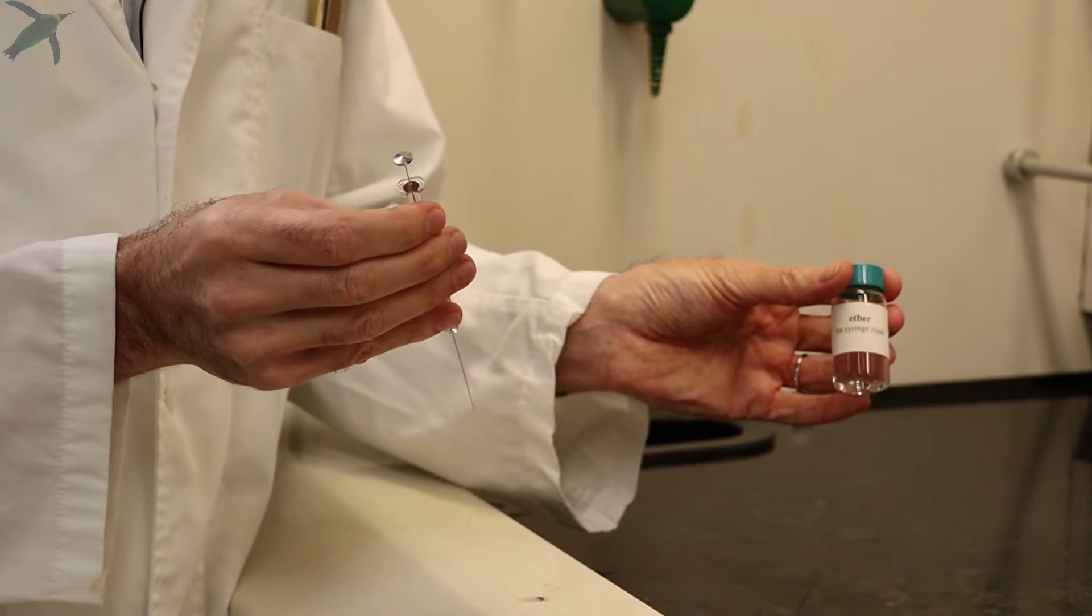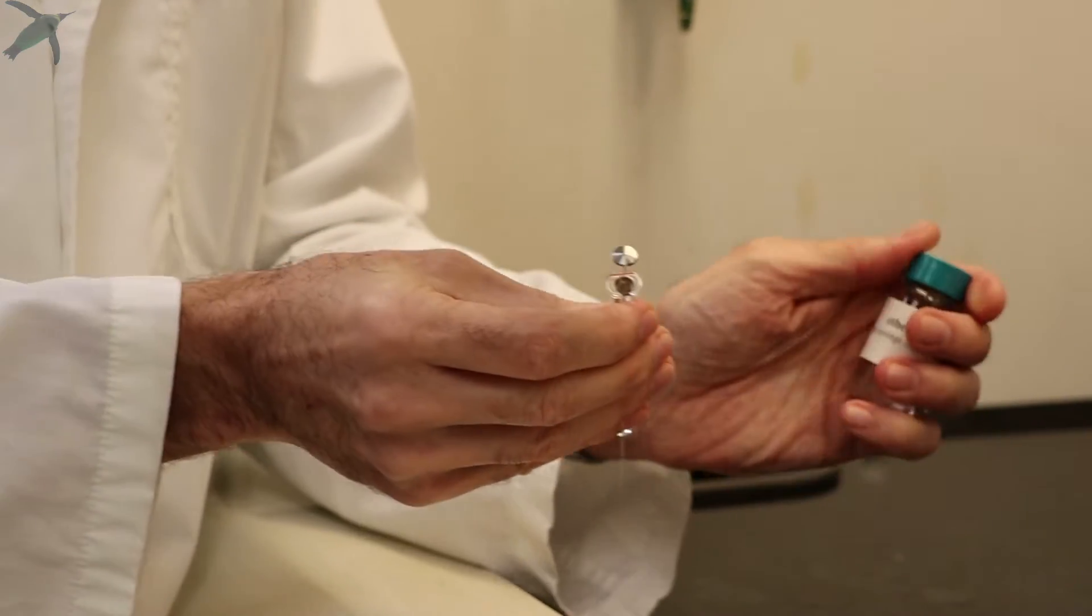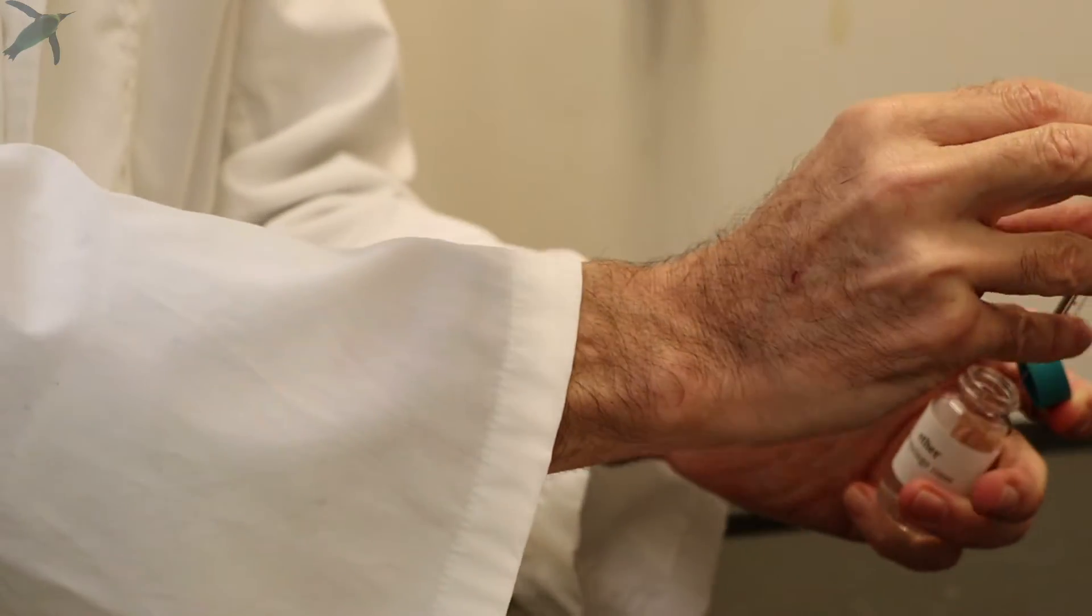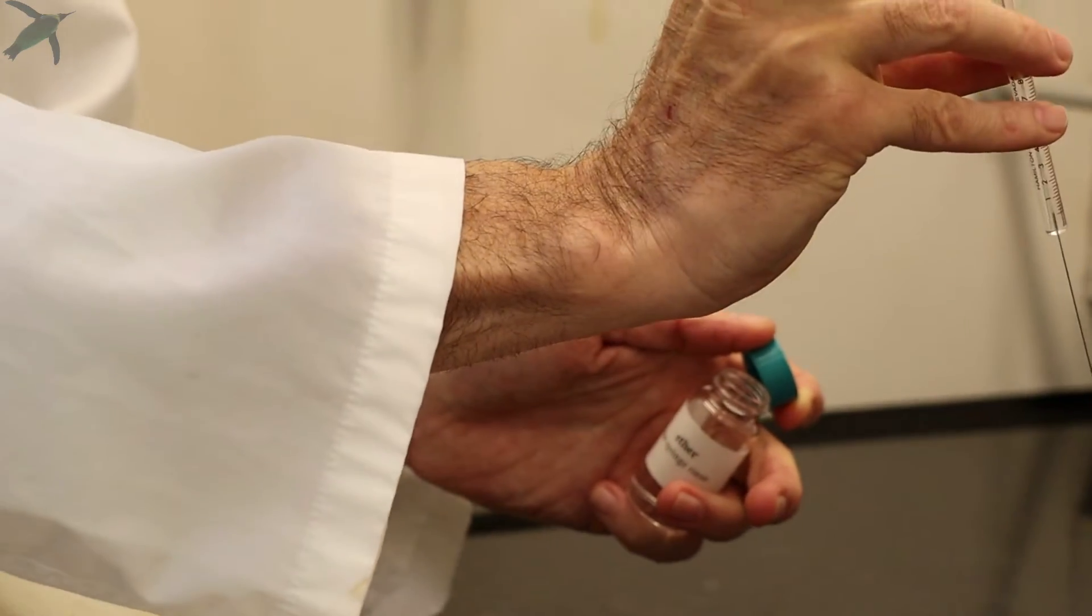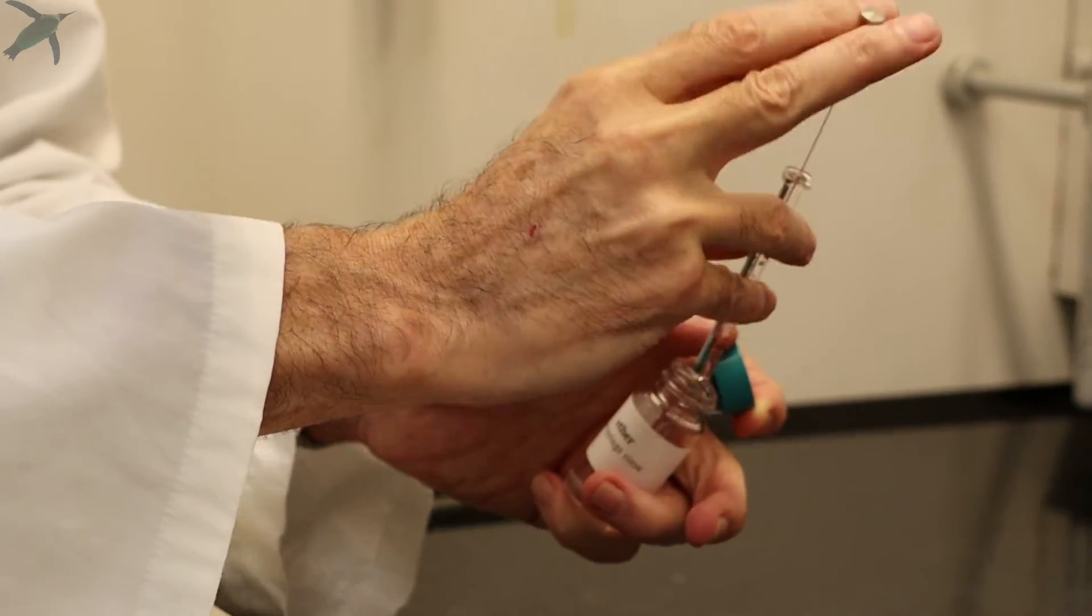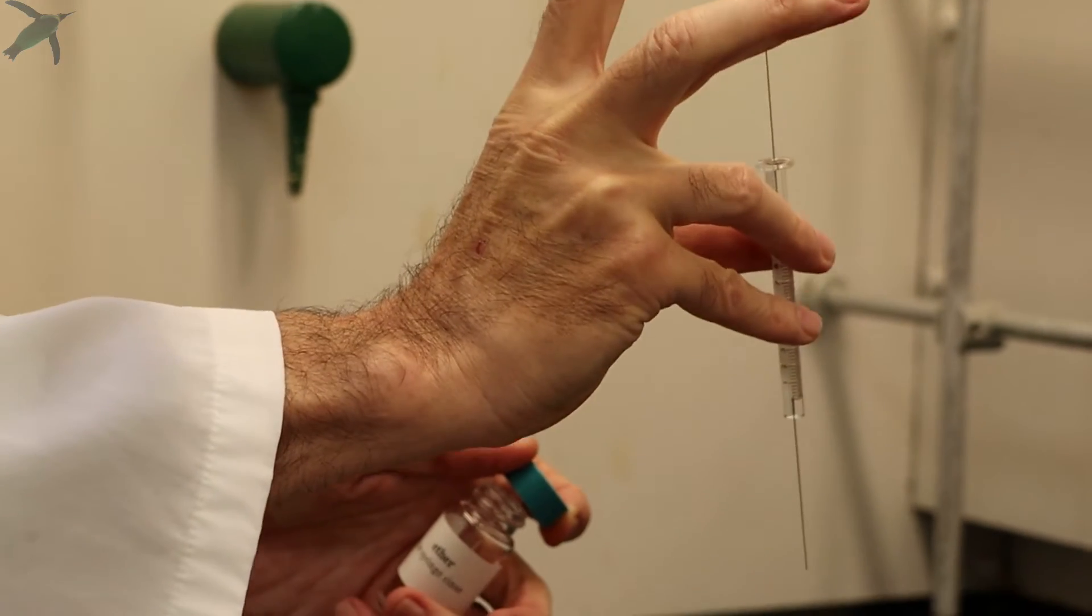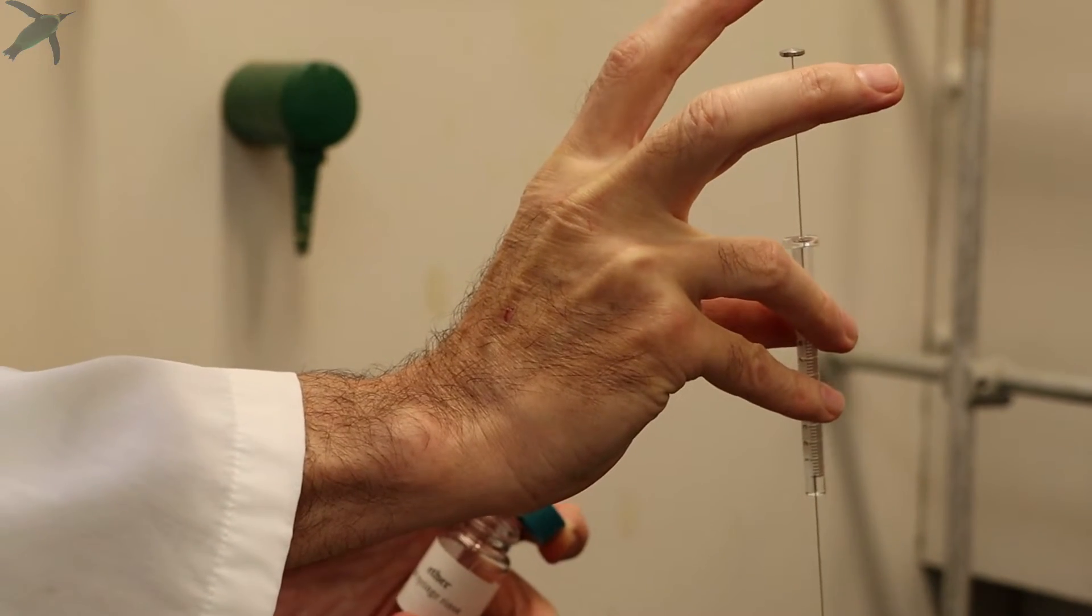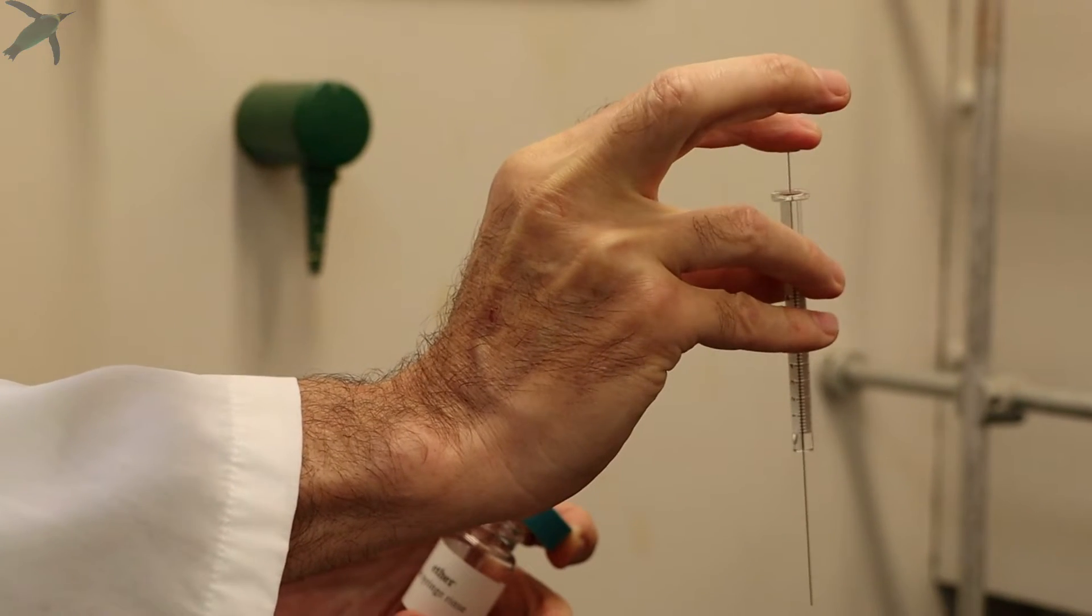So you rinse the syringe with ether a few times, and just out of safety you want to do this in the hood. You open the container, draw some ether, and you can eject it in the hood. Make sure when you push the plunger down to do it quickly but gently so you don't bend the plunger.